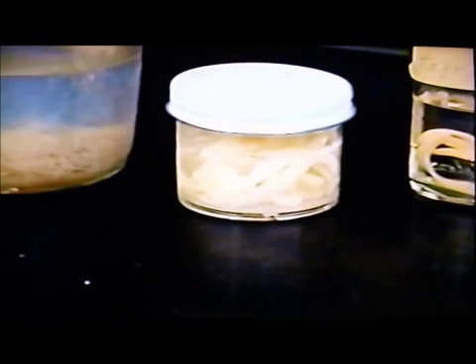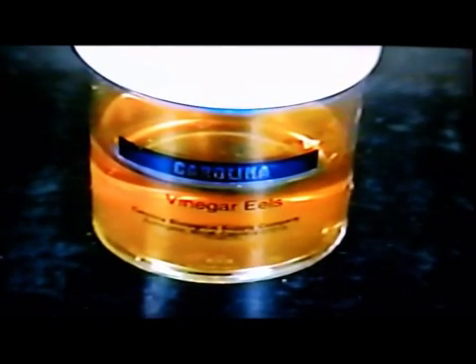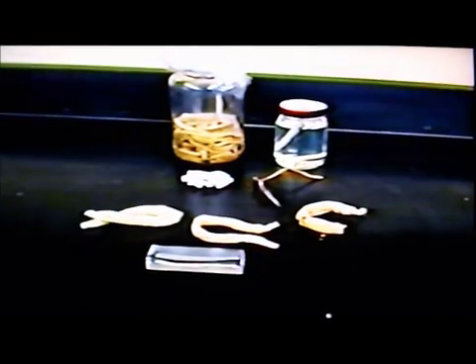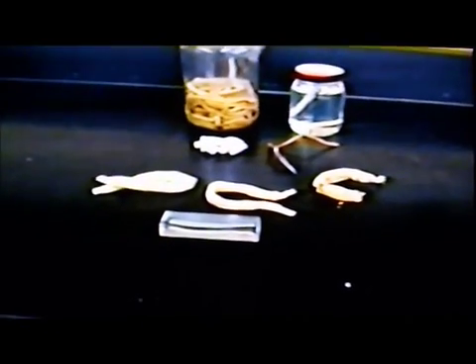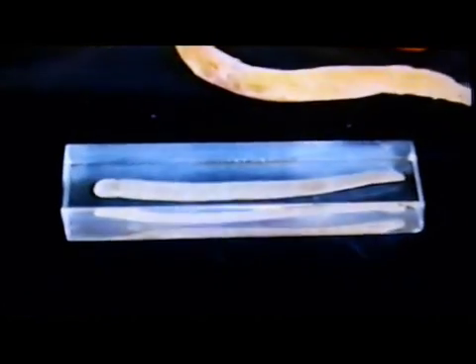When investigating worms, we study three phyla. Under the microscope, we inspect the planarian with its weird eye spots. It is a flatworm in the phylum called Platyhelminthes. The next worm, also viewed under the microscope, is a smelly vinegar eel in the phylum Nematoda, or roundworm. The last worms, from the phylum Annelids, or segmented worms, are too large and must be viewed from trays. They are live earthworms brought in by our students, as well as preserved catalog specimens.